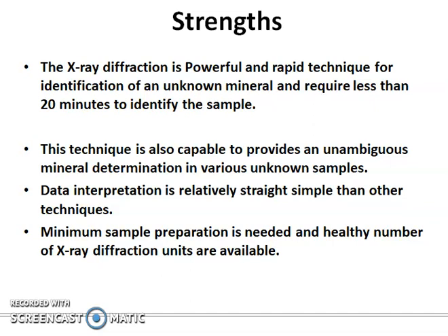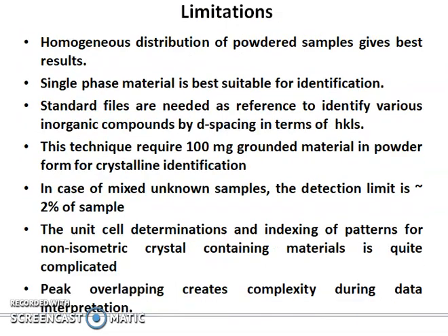For fiber-type samples, suppose you prepare the sample. After the X-ray diffraction, no morphological changes take place after the X-ray analysis. So the same sample can be used for thermal identification, particularly for DSC and TG. So if you have to do all three experiments, we should start from X-ray diffraction.